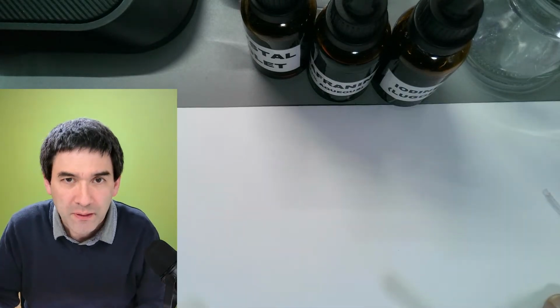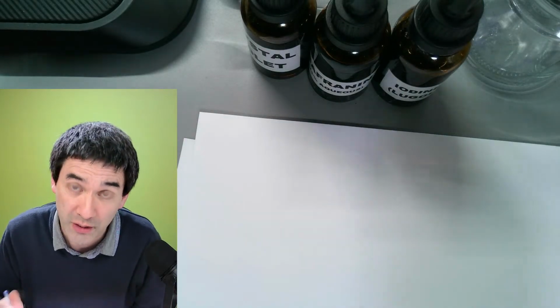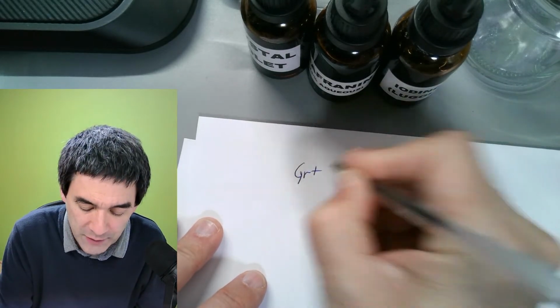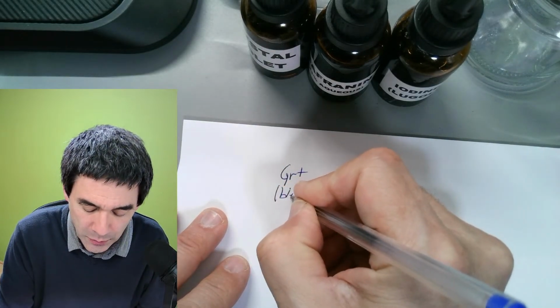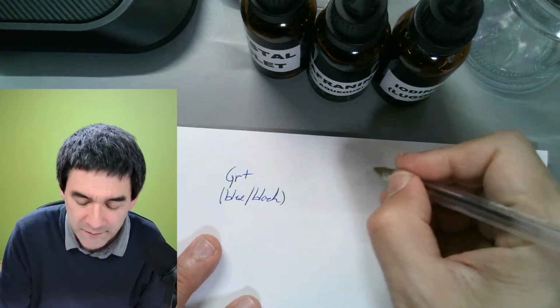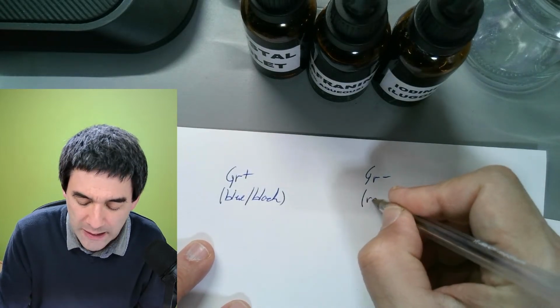So essentially, from the cell structure, there are two different types of bacteria around. The one is called gram-positive. I abbreviate this with GR-positive. They stain blue-black. You've seen them just before. And the other ones are called gram-negatives. I abbreviate this with GR-negative, and these stain red.